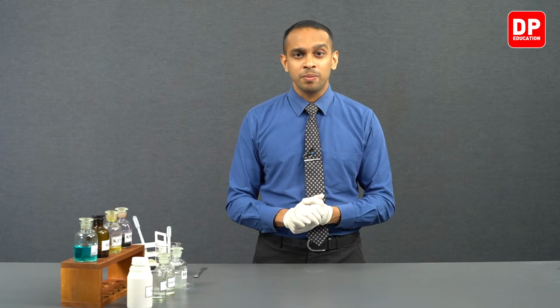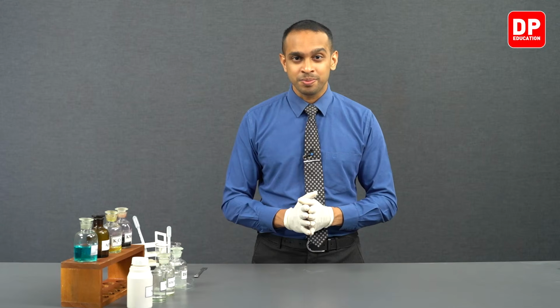So lead sulfide was formed when the hydrogen sulfide gas came into contact with the lead acetate that was present on the filter paper. So this was another experiment that we could use to identify the presence of sulfide ions.